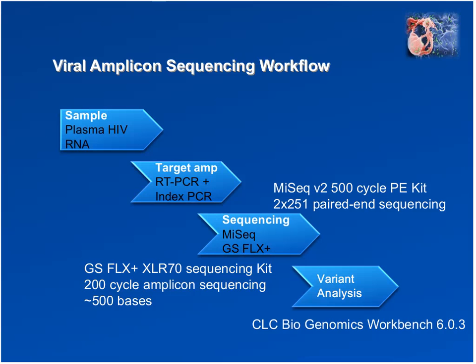It was the easiest application to implement here, and as I said, it will take data from multiple platforms, and it has the ability to set up workflows, so it will process through your data automatically. I have to say that from my perspective, as I sit here today, that's the application that I would go forward with until perhaps another application comes available where it might do some more automatic reporting of data.